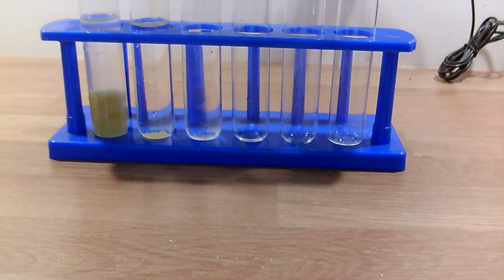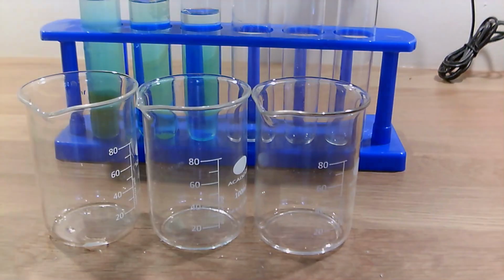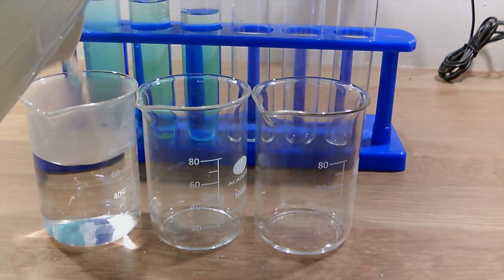Then we are adding Benedict to the test tube again, and we are also using the kettle again to add the hot water to a beaker that we are putting the test tubes into.